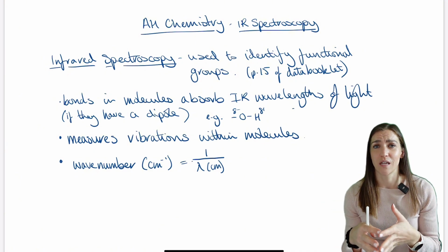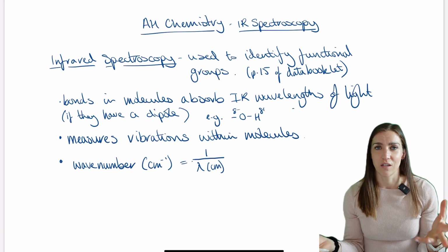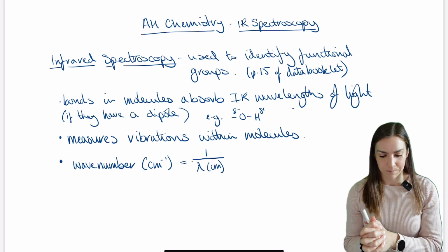It's not going to be able to tell you about anything to do with carbons bonded to other carbons, if it's just a regular carbon-to-carbon single bond, or things like that. So we're really looking at functional groups when we're looking at infrared spectroscopy.